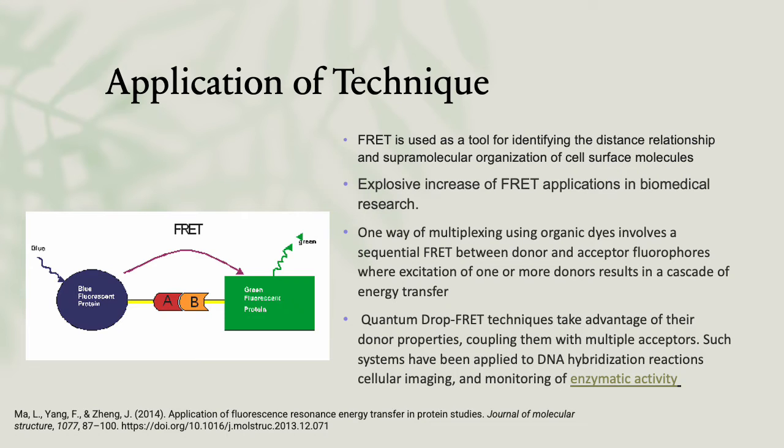Quantum dots are inorganic semiconductor nanocrystals, and they exhibit unique photophysical properties such as broad absorption bands and narrow emission spectra that can be tuned by varying the size of the nanocrystal. And then the quantum dot FRET technique takes advantage of their donor properties, coupling them with multiple acceptors. Such systems have been applied to DNA hybridization, cellular imaging, and monitoring of enzymatic activity.